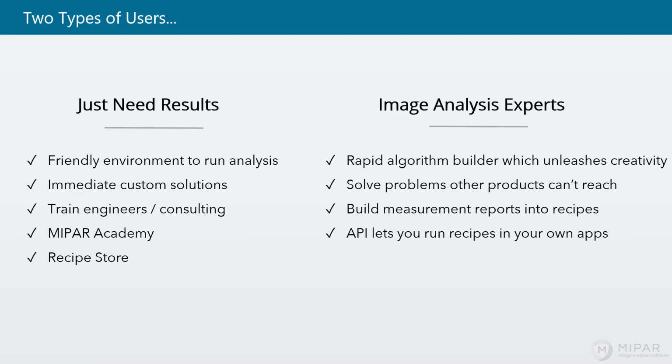As you saw during today's demos, simple drag and drop is all that's required to execute these powerful solutions. As I've mentioned, these solutions are almost always custom built to your particular problems and your particular challenges.